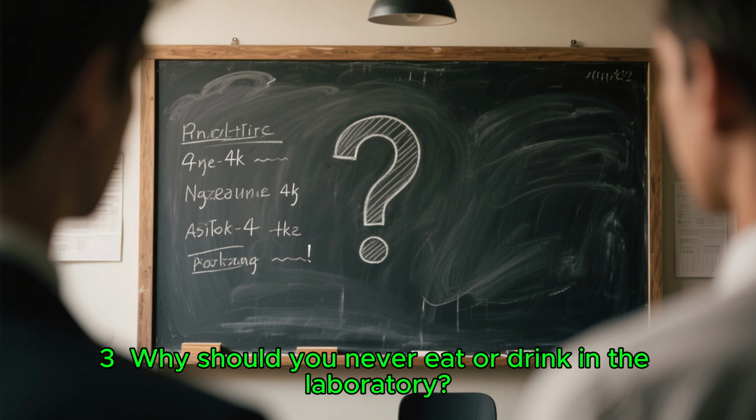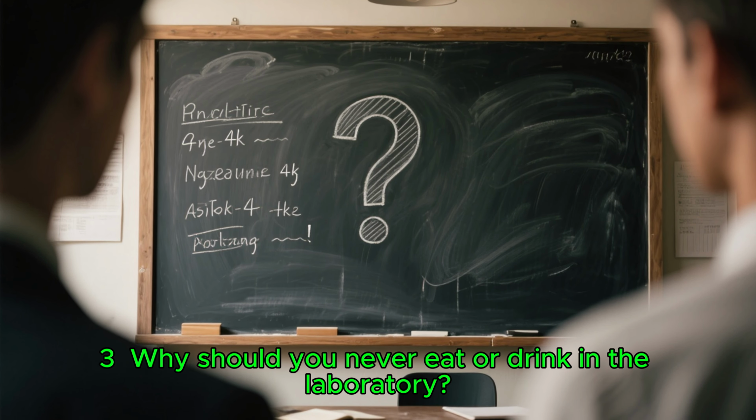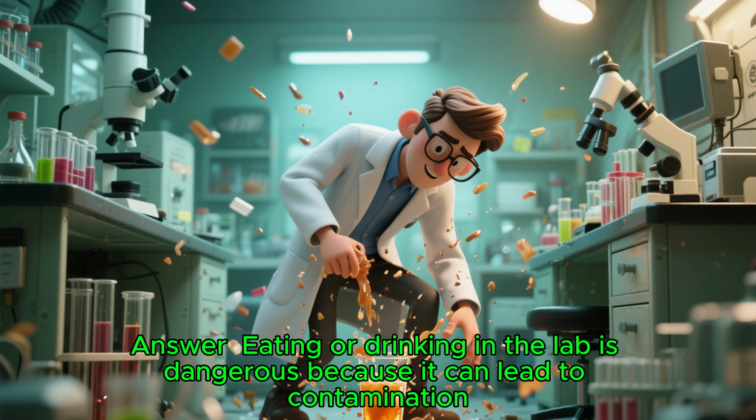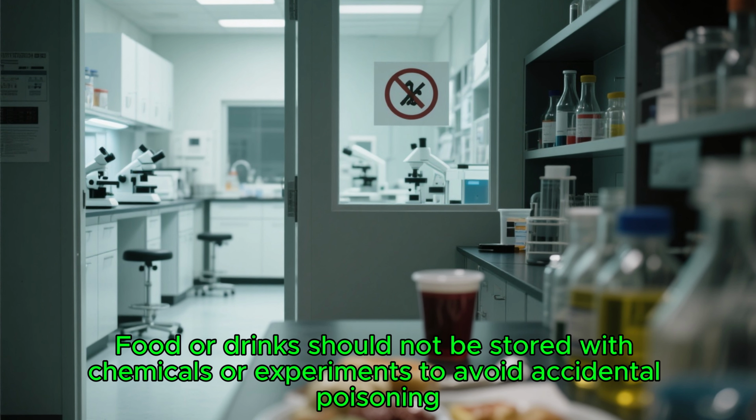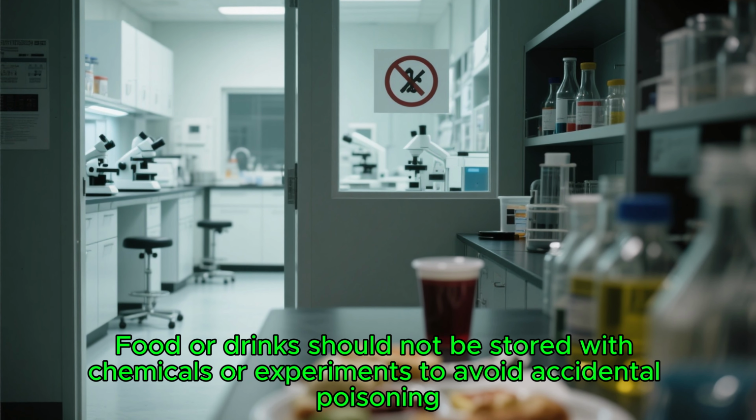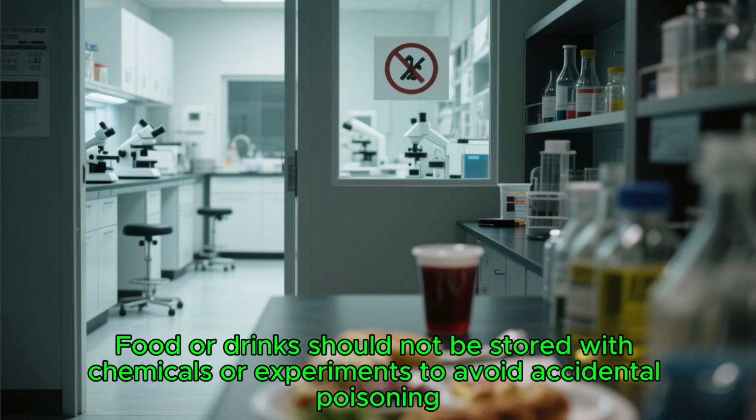3. Why should you never eat or drink in the laboratory? Answer: Eating or drinking in the lab is dangerous because it can lead to contamination. Food or drinks should not be stored with chemicals or experiments to avoid accidental poisoning.